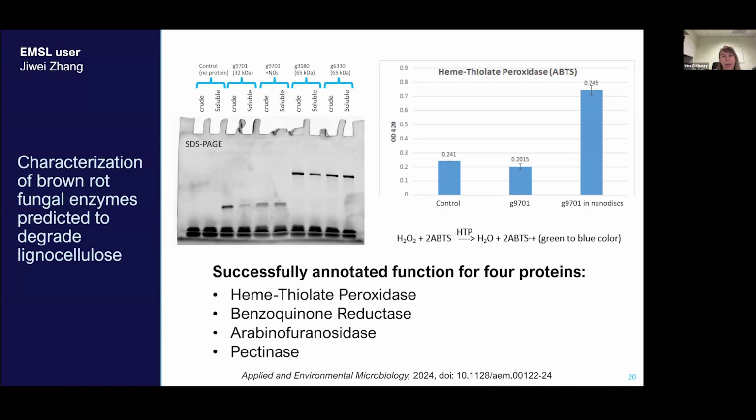To compensate for that, the cell-free pipeline has an ability: you can add any additives that you like, to some degree. So for membrane proteins, we usually add nanodiscs, so we can maintain the proper folding environment and keep them soluble, and therefore functional. You can see it in lanes 5 and 6, and lanes 7 to 10 show a few examples in the case of soluble proteins. So for his particular case, we targeted a range of soluble and membrane proteins. And once we obtained those proteins, they were subjected to different functional assays.